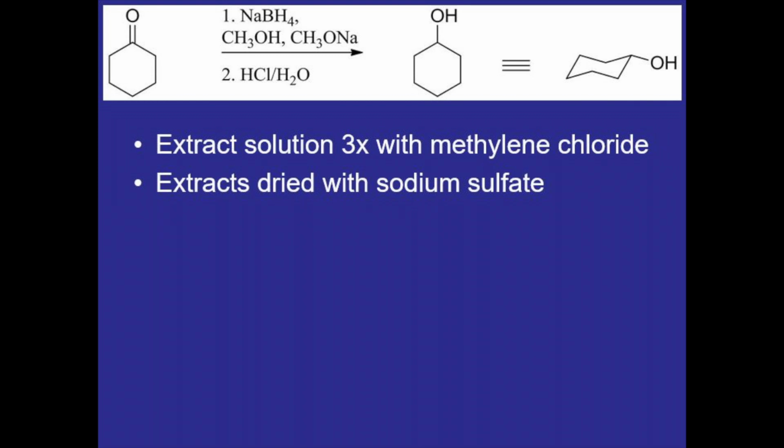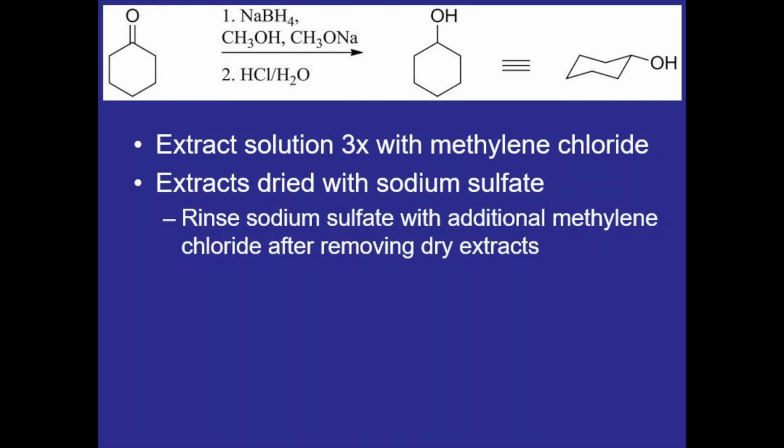The extracts will be dried with sodium sulfate, which will be added until it's free-flowing, and after the dry methylene chloride solution is removed, we'll rinse the sodium sulfate with a little additional methylene chloride to help reclaim any product that would have been left behind or would have been trapped within the sodium sulfate.